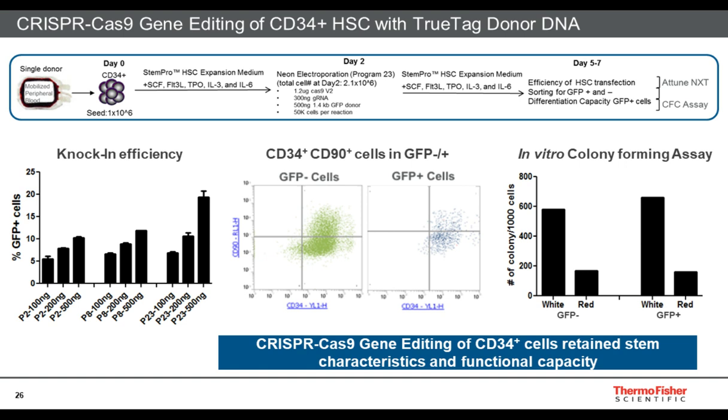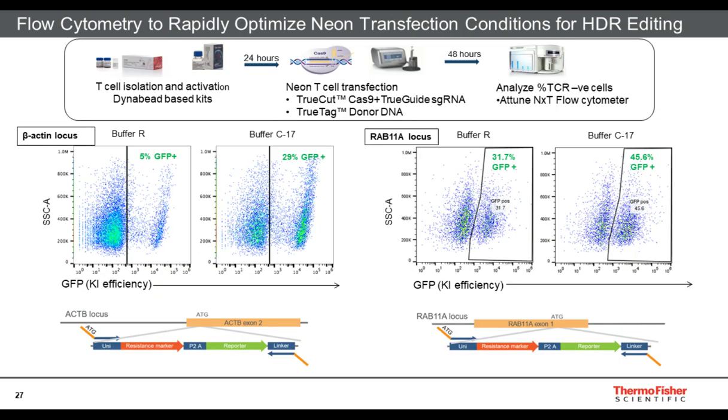And that's just another level of rigor, something that I touched on before and wanted to add again: as you're doing these gene editing experiments, flow cytometry also gives you the ability to look at a lot of different parameters of interest at the same time, to ensure that your cells are not being affected in some other way that you did not plan on, and also ensure that you still have functional capacity. This is also, of course, very relevant for iPSC studies, being able to use flow cytometry to verify that your cells are still expressing the appropriate pluripotency markers at the end of your experiment.